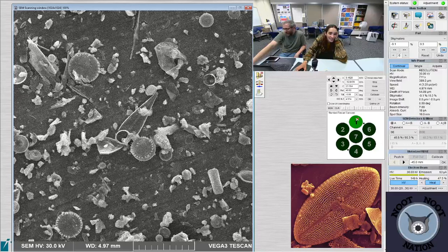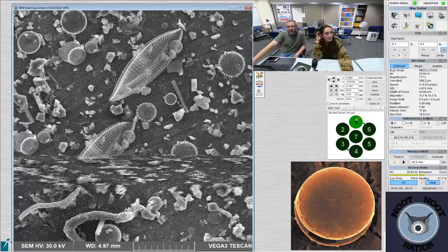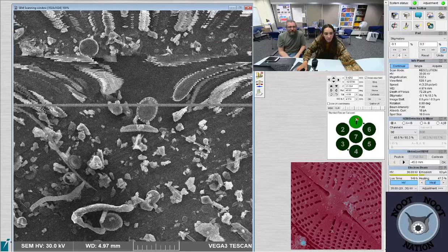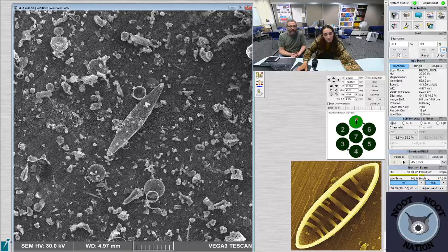Is it as simple as scooping up water to get new samples? It can be. More frequently, we scoop up mud. But the density of diatoms in a typical scoop of water is pretty low. So if you're going to scoop water, you probably need to use a milk jug and scoop a gallon of water. Then I would let it settle for 2 days and drain all the water off so there's just a little bit at the bottom where all of the diatoms would have settled. Or you could just collect a bit of material from the mud itself, depending on whether you want to look at living diatoms or dead diatoms or some combination. In the sediment, you'll get a mix of things that have fallen through the water column and are dead, or things that are living on the surface and in the surface of the sediments themselves.